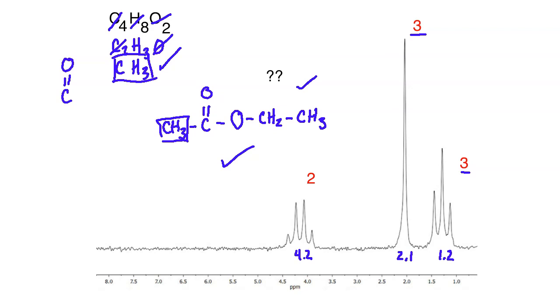So notice, and you could have solved the degrees of unsaturation for this. It might have helped you. But when you look at this, for simplistic molecules, you tend to be able to solve the structure simply through the proton NMR alone. And that's why I have stressed throughout this, the proton NMR is the most useful of the specs. Now, that's just my opinion. There's no given fact about that. However, because of the splitting patterns and the integrations that you can pick up on, it's going to give you the ability to go through and deduce until you get to the most plausible structure. And you could even get a little more advanced than this and probably still get away with it. When you get into more complicated molecules, you want your mass spec and your IR.